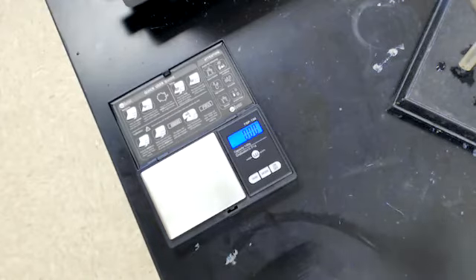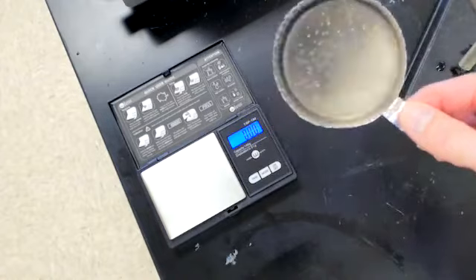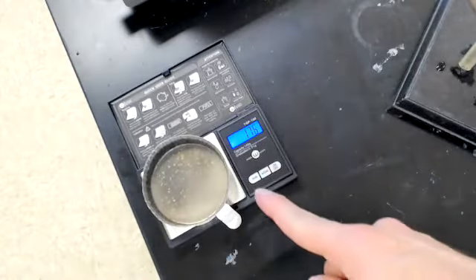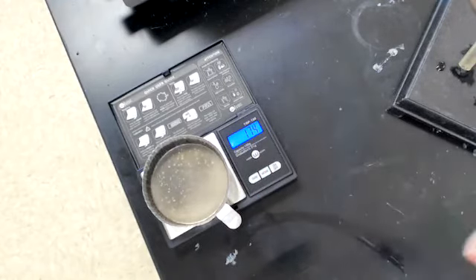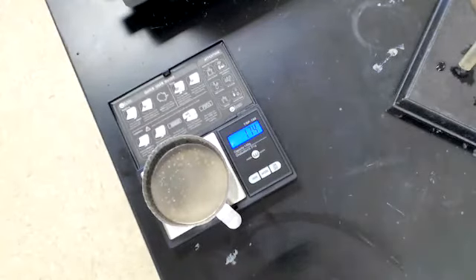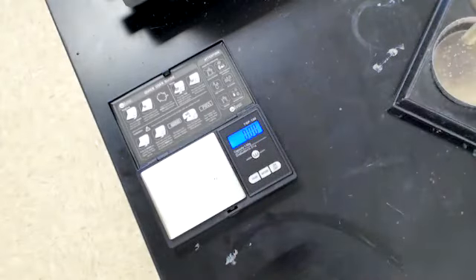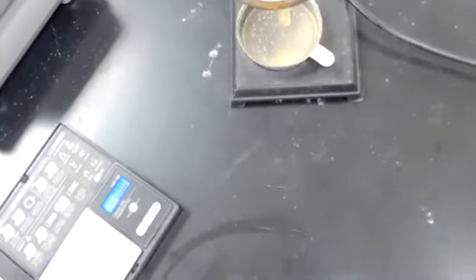Okay, I'm back with it clean and dry. I made sure it was dry so the water doesn't do anything. And I'm going to put it back. So this is back on number 12. This number that I'm about to say goes on step 12. Step 12 is 1.74 grams. Okay, so sorry about skipping that step. I just got so excited about doing the filtration that I totally forgot to measure that. But there you go. You have all that you need to make up this lab now.